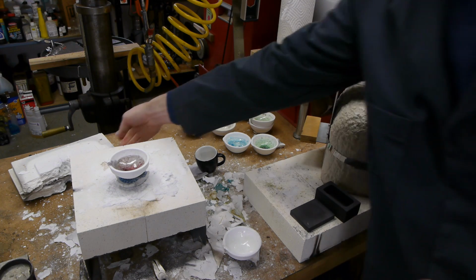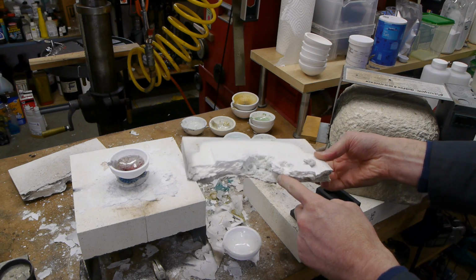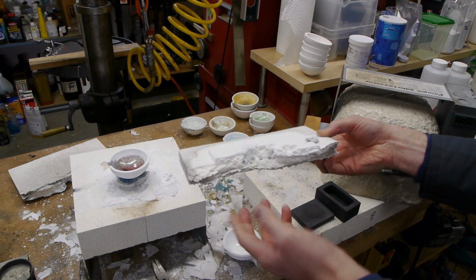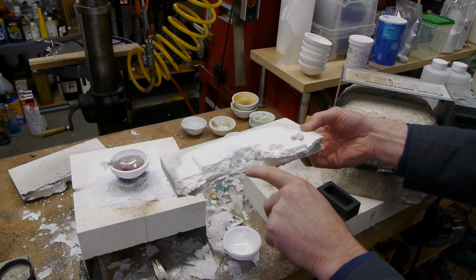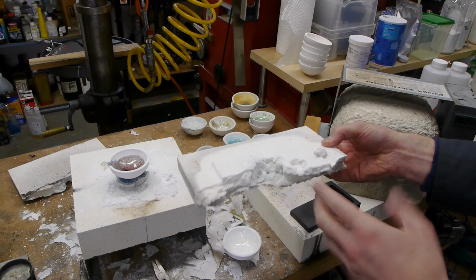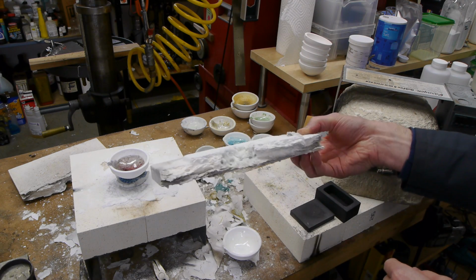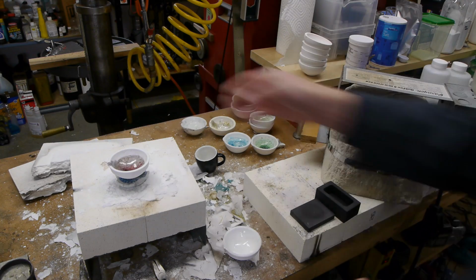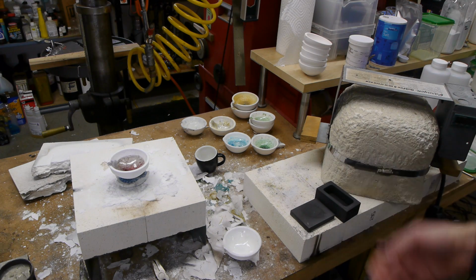This kiln originally came with its own shelf, like its own bottom, and you can see what happened here. Now remember I said that glass is very reactive, so if you spill a little bit of glass batch on the shelf here and then heat it up to high temperatures, it's actually dissolving away the material of the kiln itself. So you have to protect the kiln and everything in there from your glass. Spilling it is a very damaging, corrosive kind of event. So luckily this material is not super expensive. And the nice thing about these muffle furnaces where you pick the whole furnace up is that you can just have a new bottom every month or whenever you need it.